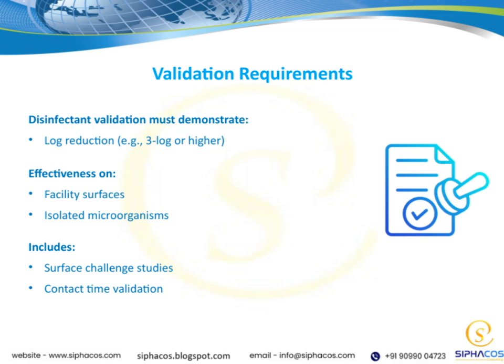This means we're aiming for a 99.9% reduction in the microbial load, which is a critical benchmark for efficacy. Next, we need to verify effectiveness on both facility surfaces and isolated microorganisms. This ensures that the disinfectant works not just in theory, but in real-world conditions, effectively reducing microbes on the surfaces we encounter daily.